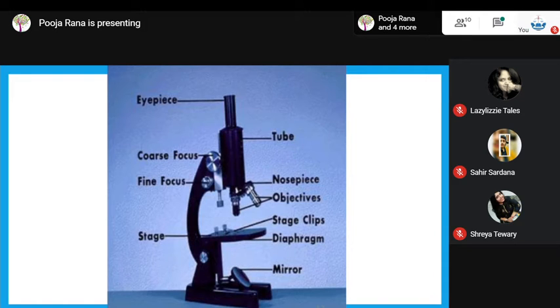Now, these eyepieces can be switched with numerous other eyepieces which can be inserted with variable degrees of magnification. Now, magnification values for the objective lens which is there, the magnification values of those objective lenses can be changed. So it can be 2x, 5x, 10x, 1.5x, and even 0.5x. All right. Now, matching of the optical configuration of objective lens and eyepiece is done with a few high performance microscopes to give the optimum optical performance. And this happens ordinarily with the apochromatic objectives.